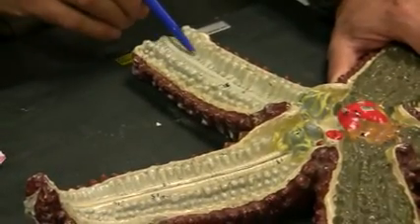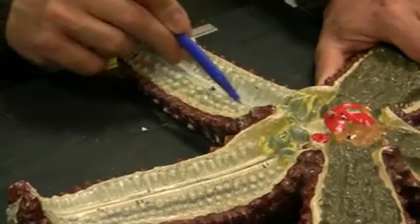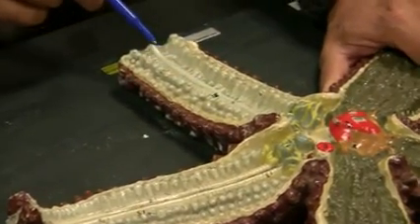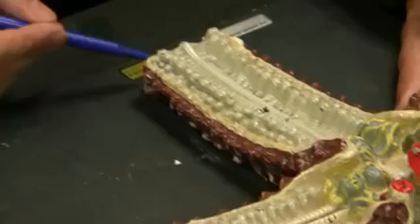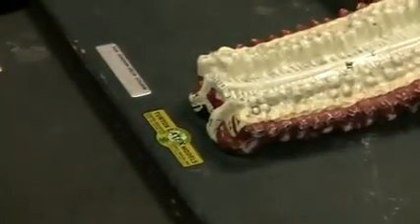Here is a tube foot again, ampulla, lateral canal, radial canal, lateral canal, radial canal. And then right here is a tube foot. You can see that tube foot.